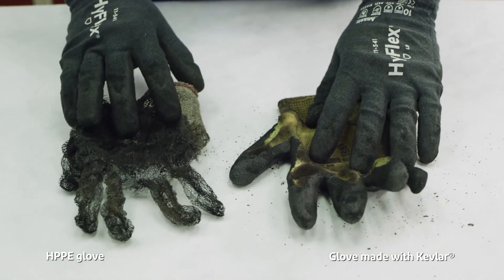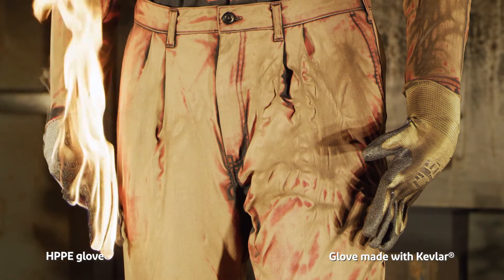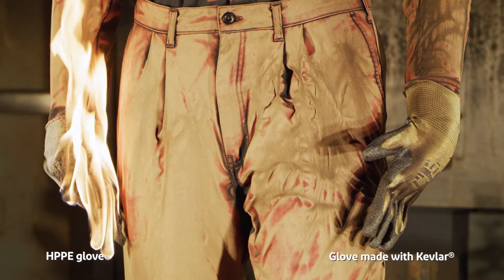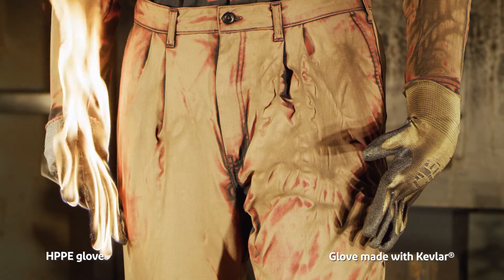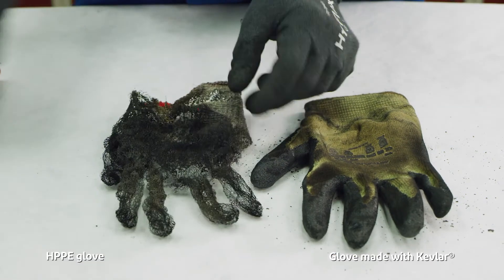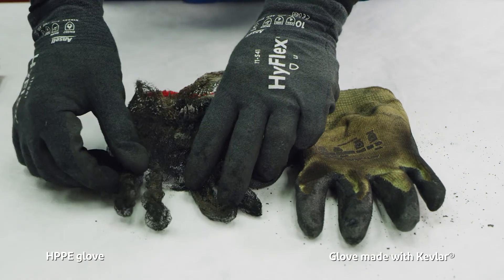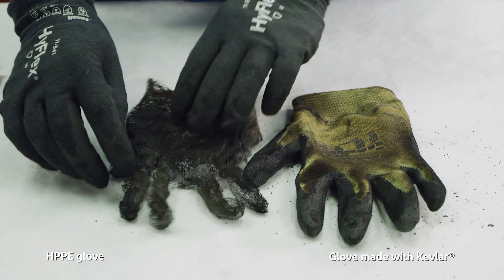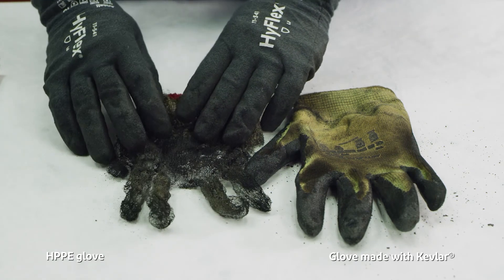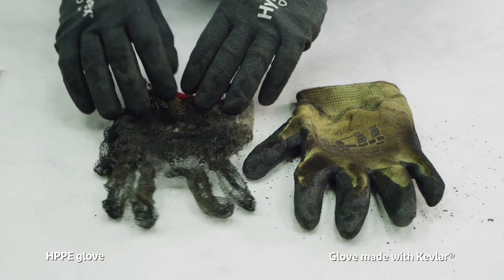Our competitive glove made out of HPPE material caught fire and started burning. We stopped the fire once the exposure was over and we could get back into the chamber. You can see from what you started with to where you are — all that's left on this glove is the fiberglass yarn core that is in there to give it cut protection, but all the HPPE material has burned away, and as a result the user's skin would also start burning in this case.